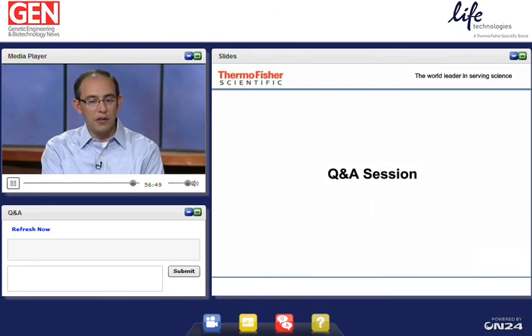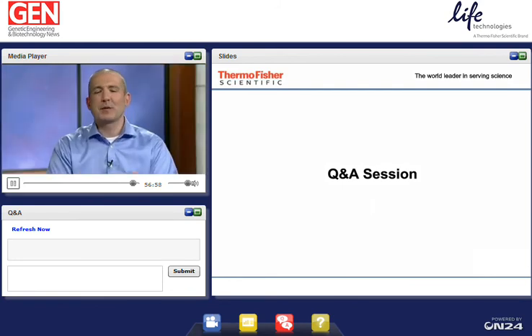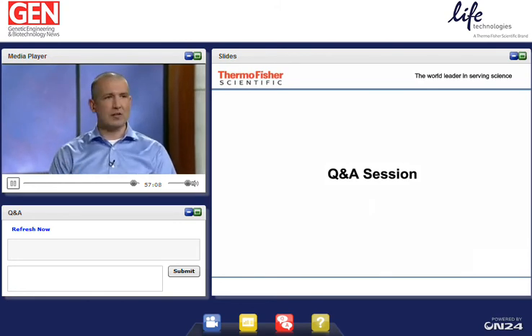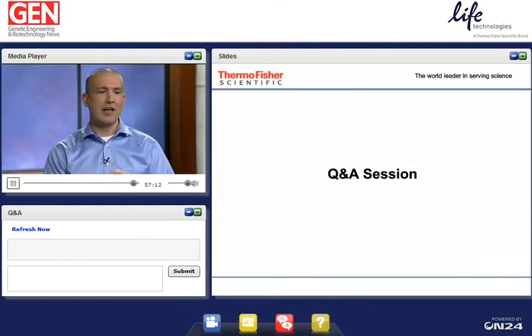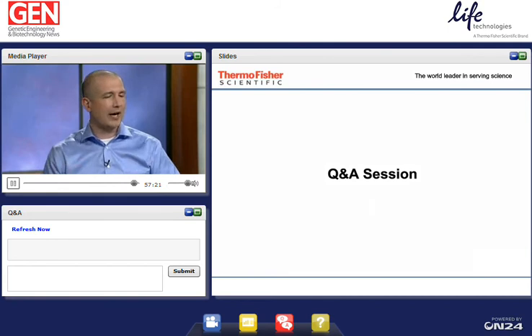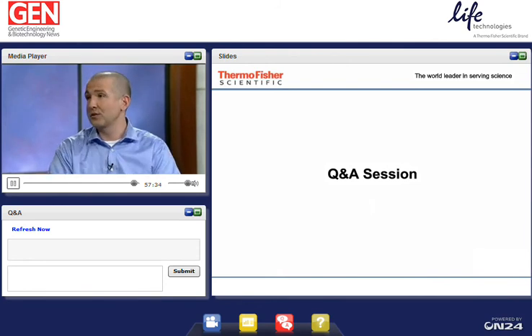Another question around the antibody use. So we talked about using the same concentration of antibody as you do in a manual blot. Is that guaranteed to work for every single antibody? That's funny, because I think early on we started out by saying, let's use the same number of molecules of antibody in the 2 mils as you would have in your traditional 10 mils. What happened was a vast majority of the people had too much signal. And they'd say, well, how do you reduce the signal? And the answer is, well, how would you do it for a manual Western? You back off on the antibody concentration. So it's definitely one of those things where you can adjust it with the concentration of antibody.